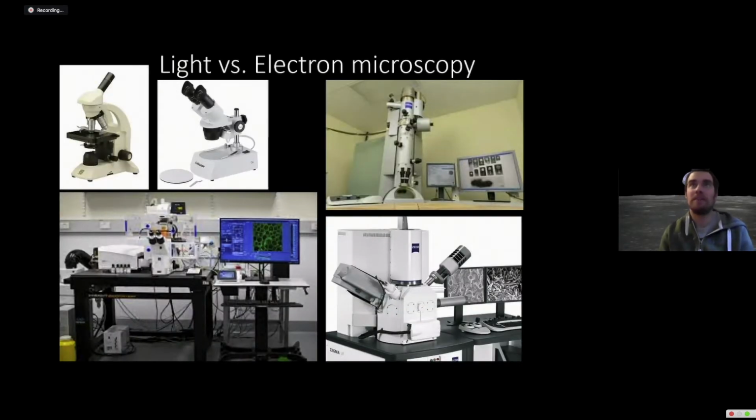And there's the idea between light microscopes and electron microscopes. Light microscopes on the left there can range in price, and you can get inexpensive light microscopes, or very, very expensive light microscopes that you can see on the bottom. But electron microscopes, everything has to exist inside a very high vacuum, almost a vacuum of space. And so living things generally can't survive that. Things that we put into the electron microscopes are almost always very, very dead and also dehydrated so that they don't turn to raisins, and often heavily processed.